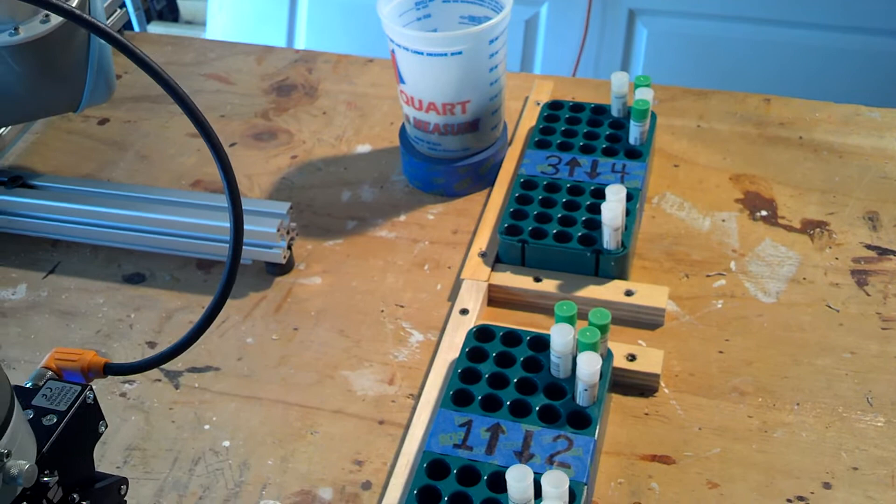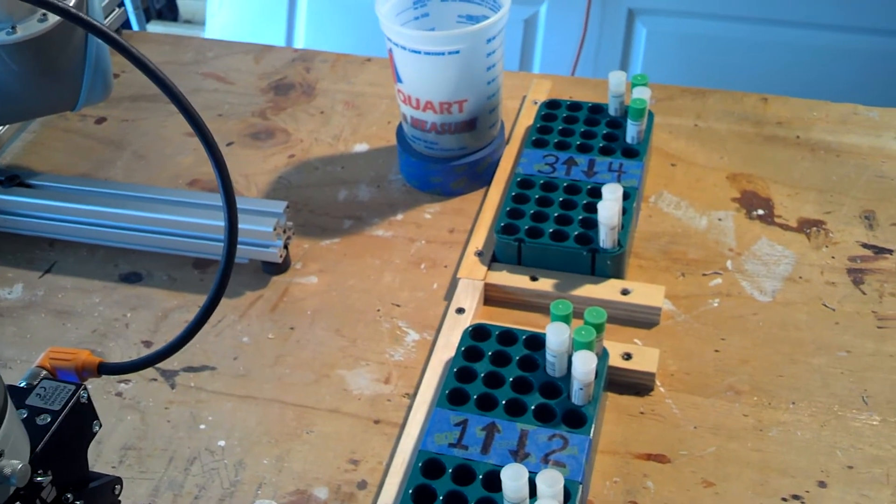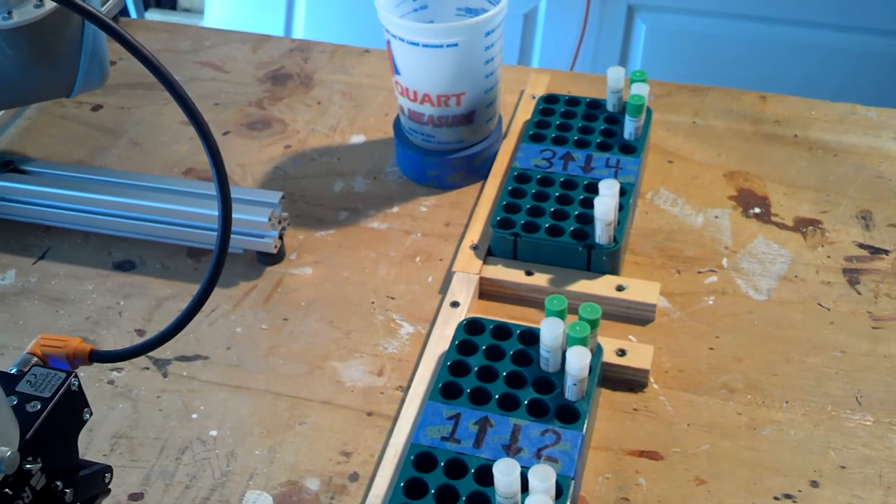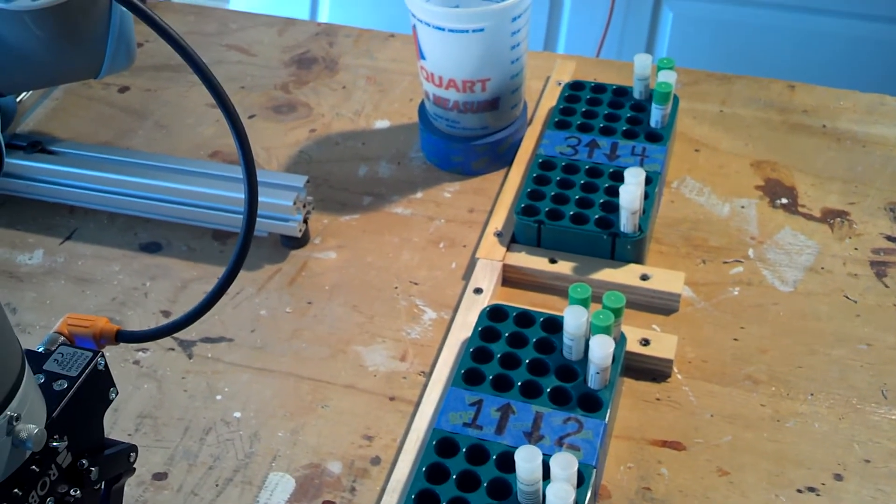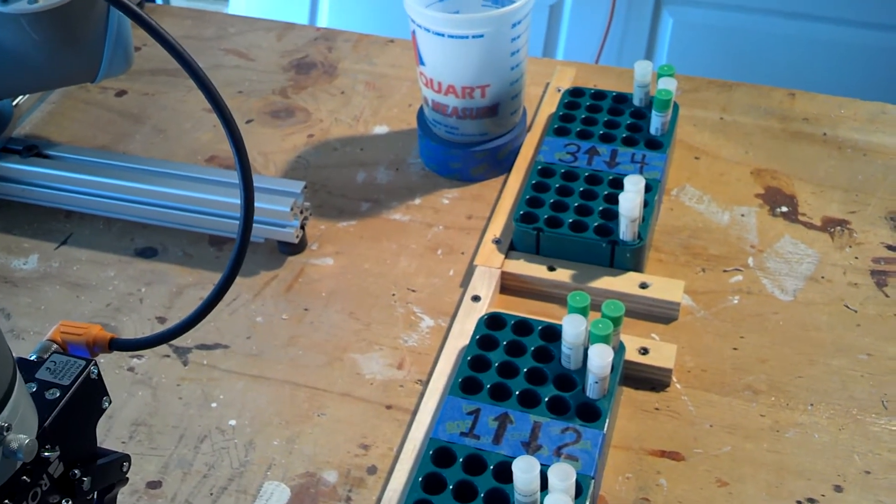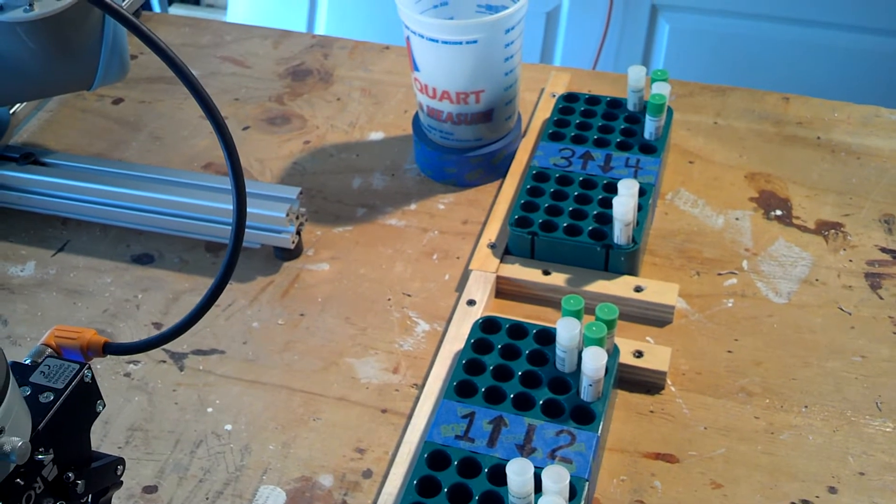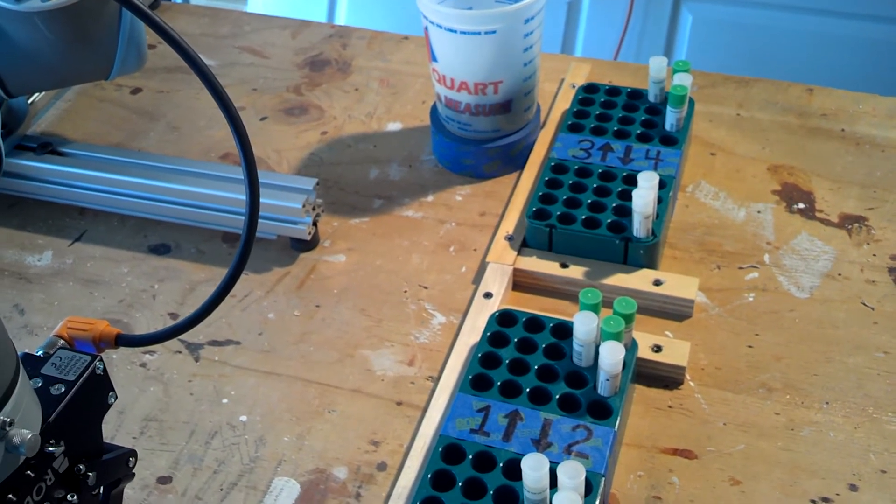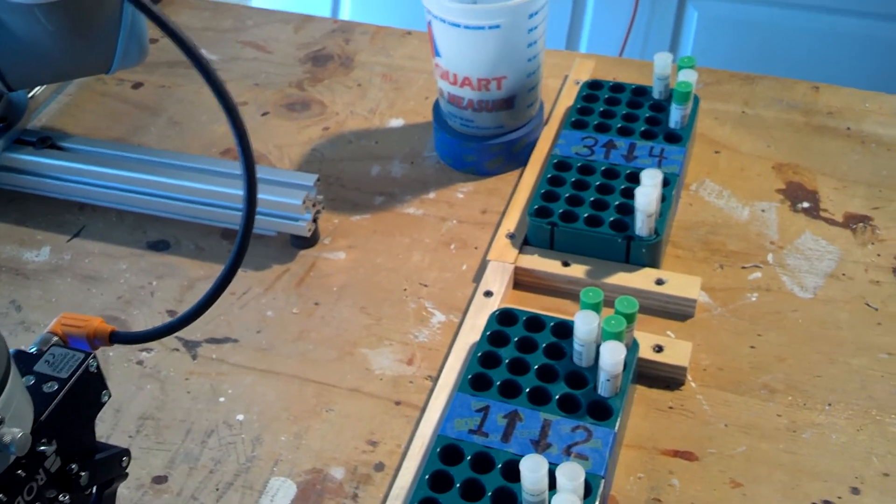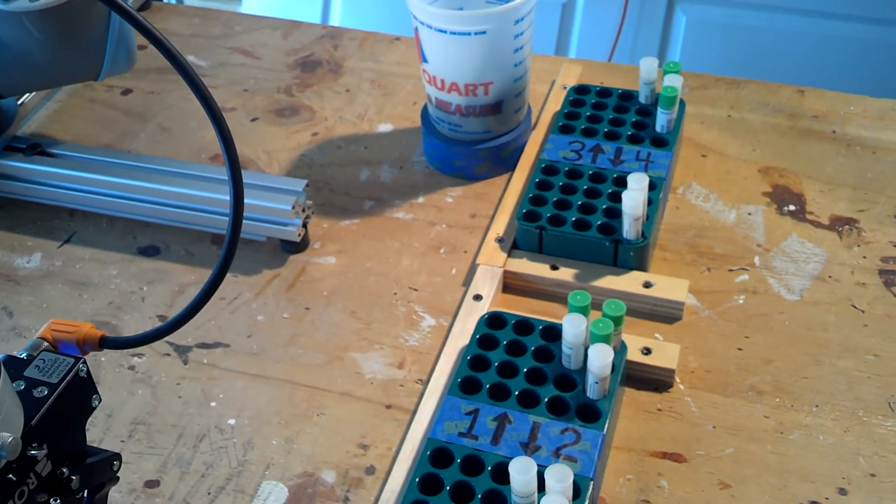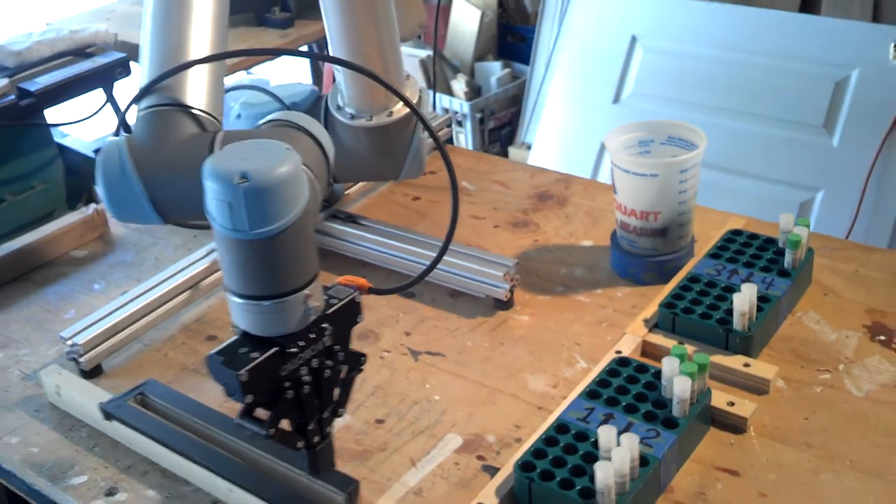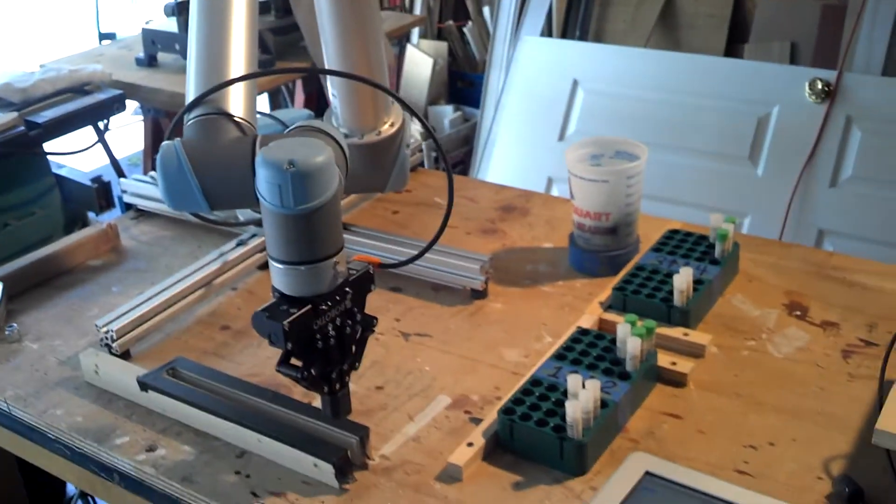So five pallets is no problem. There's really no limit that I know of, but it would probably be good to start with three or four or five. There's the whole setup there.